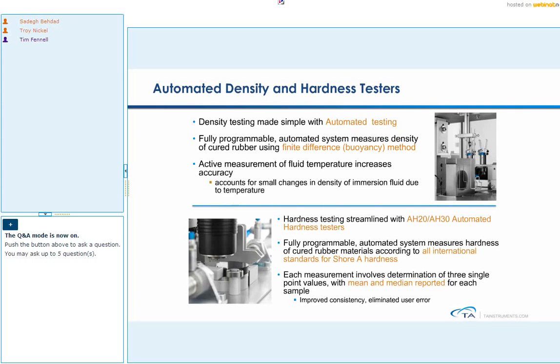So it relies on measuring the weight of the sample dry and then immersed in a fluid, usually water, and you would correct the density of the water for temperature to have very accurate measurements, and then you get to choose to dip it a few times to make sure that it's fully wet before you take these measurements, and then you compare the weight of the rubber piece inside water and in air, and this way you can measure the volume of the specimen with a high accuracy irrespective of its geometry. So that's how you would measure the density.